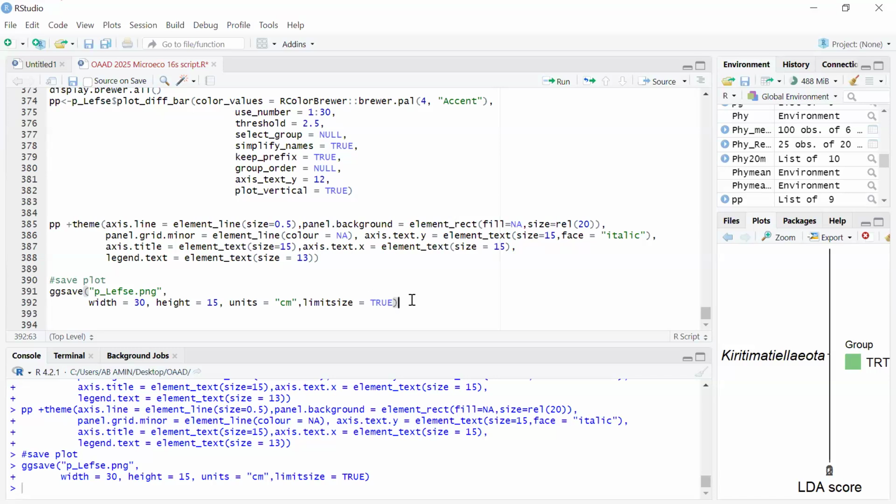Then you can do other steps of analysis to characterize them and then release it as a new bacteria strain that you have identified as a result of your study or from your environment.